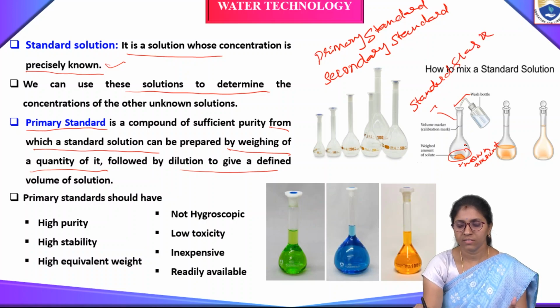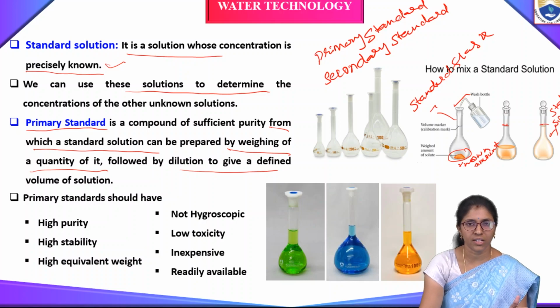So after that we have to add water up to the mark. This is having one mark, up to the mark we have to add water. So here this is a standard solution. Like this we have to prepare standard solutions by using a standard flask.